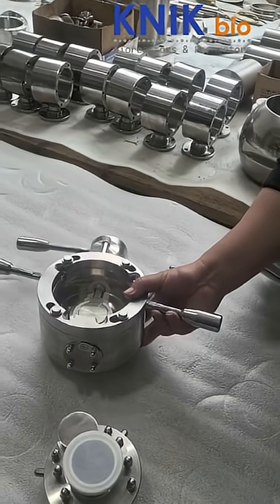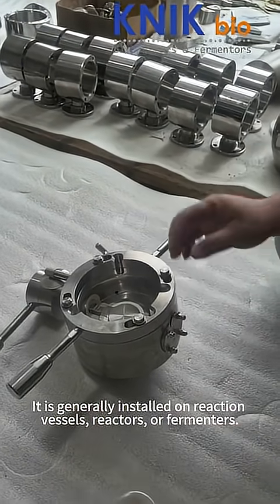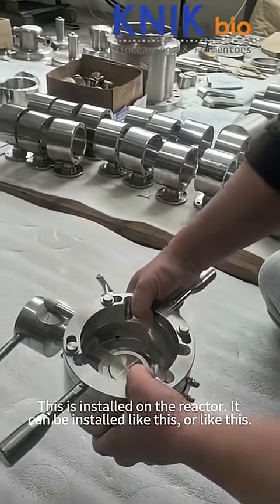Now we introduce the AB valve. This is two inches. It is generally installed on reaction vessels, reactors. This is installed on the reactor.